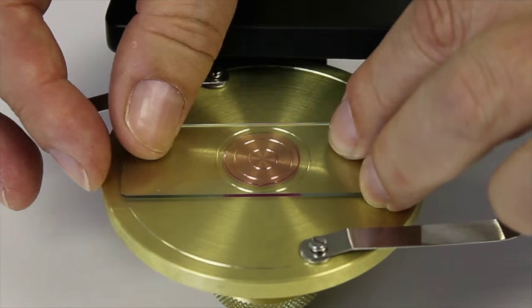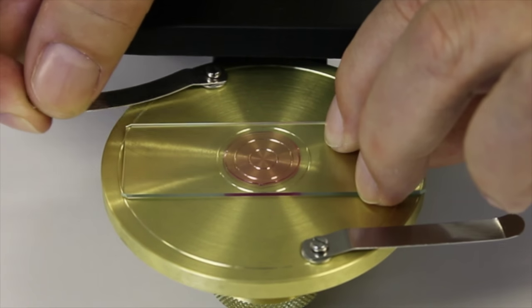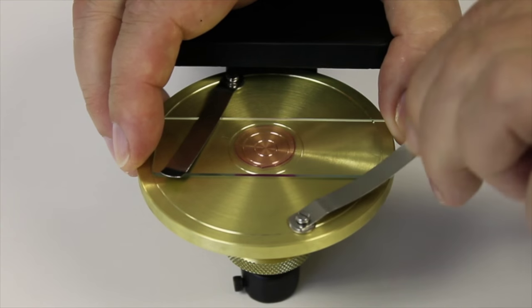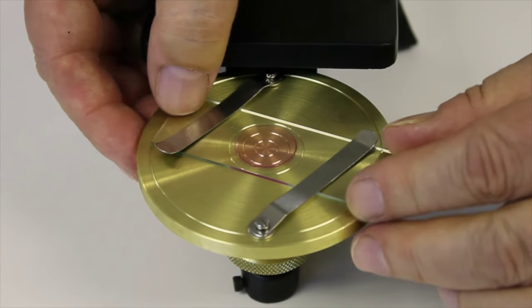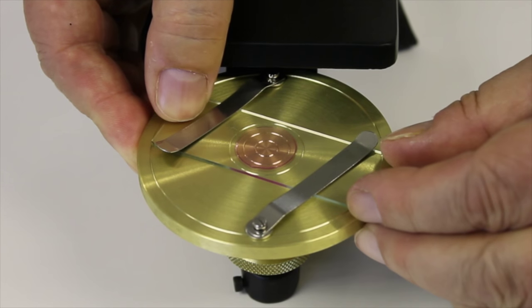It is important that the specimen and mountant have been placed in the center of the slide. A crosshair target is supplied with the ringing table for this purpose.